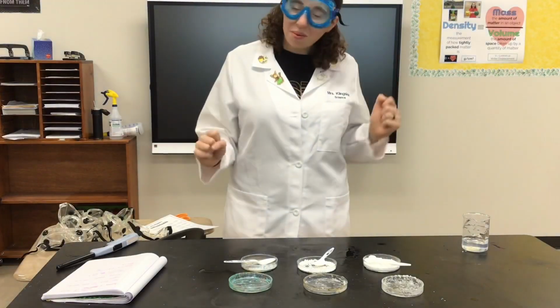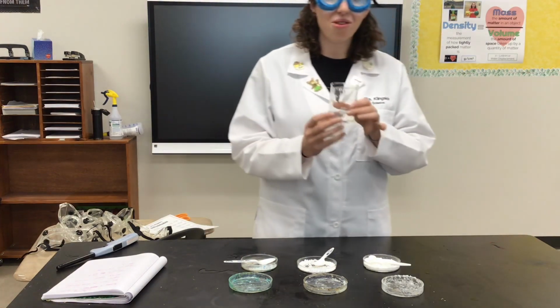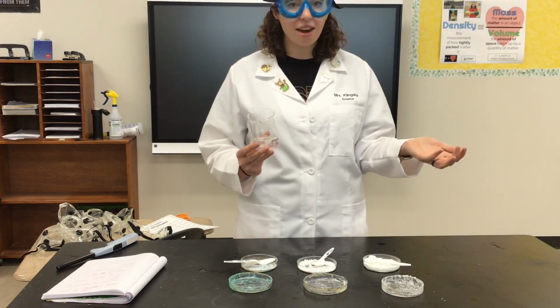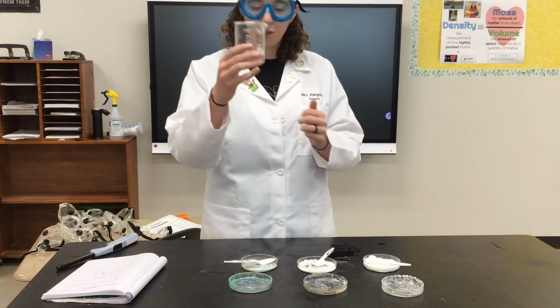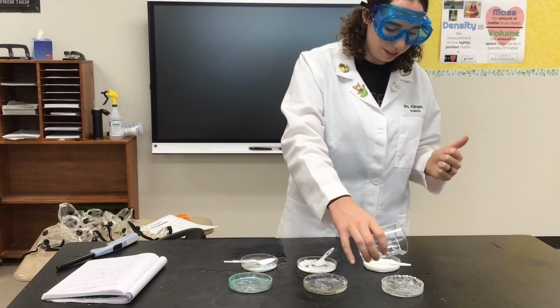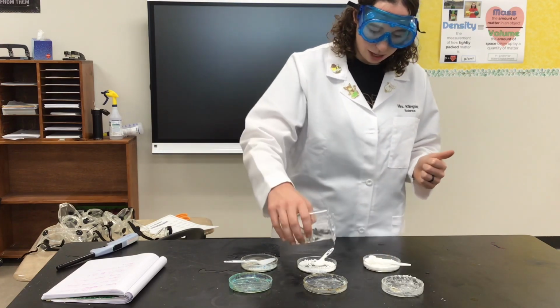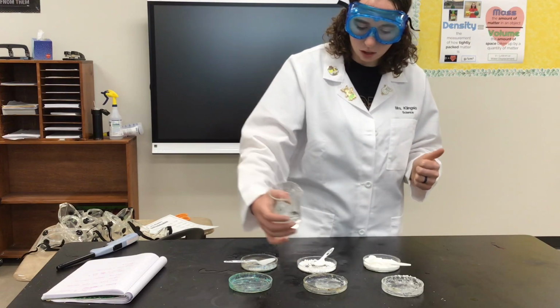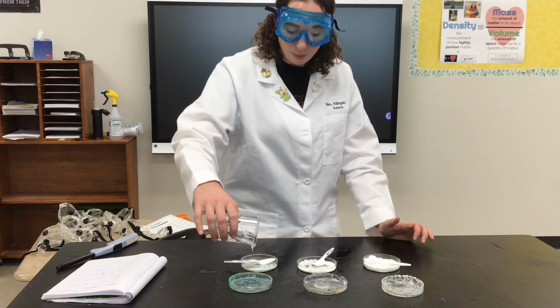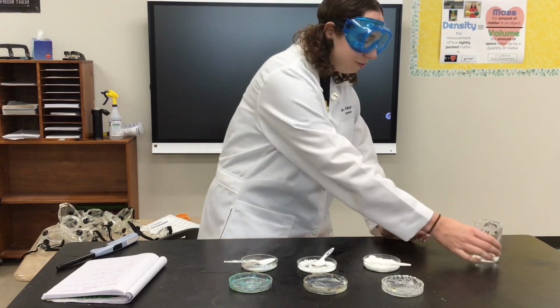All right, so the next one we're gonna do is burning salts. So what I have here is ethyl alcohol. This is like the stuff you find in hand sanitizer that kills the germs on your hands. And so it's pretty viscous, it looks like hand sanitizer. So here's ethyl alcohol. I'm gonna put some in each Petri dish. Now we talked about chemical properties. Chemical properties are if something is able to change chemically. One of the chemical properties we talked about is flammability.